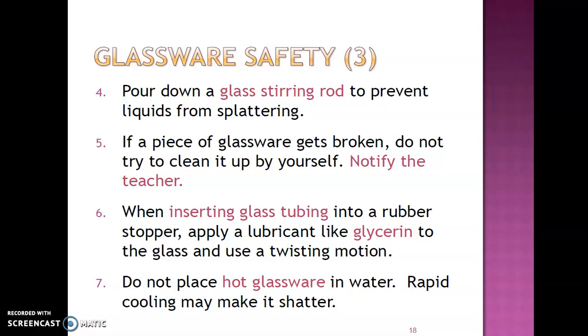When inserting a glass tube into a rubber stopper, apply a lubricant like glycerin to the glass and use a twisting motion. Do not place hot glassware in water. Rapid cooling may make it shatter.